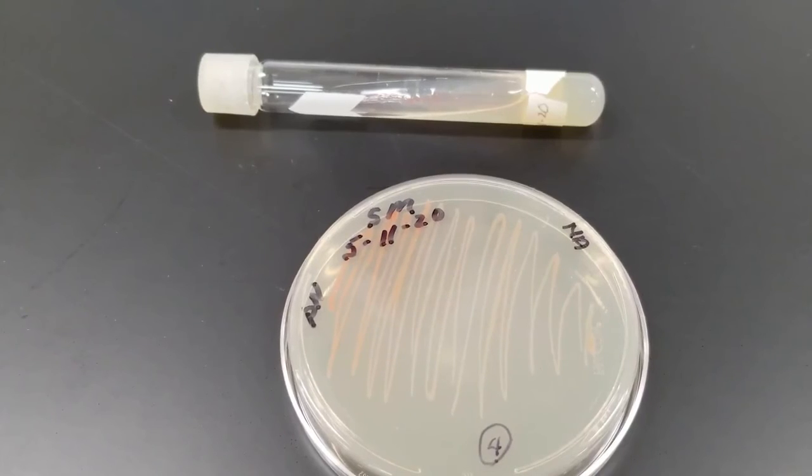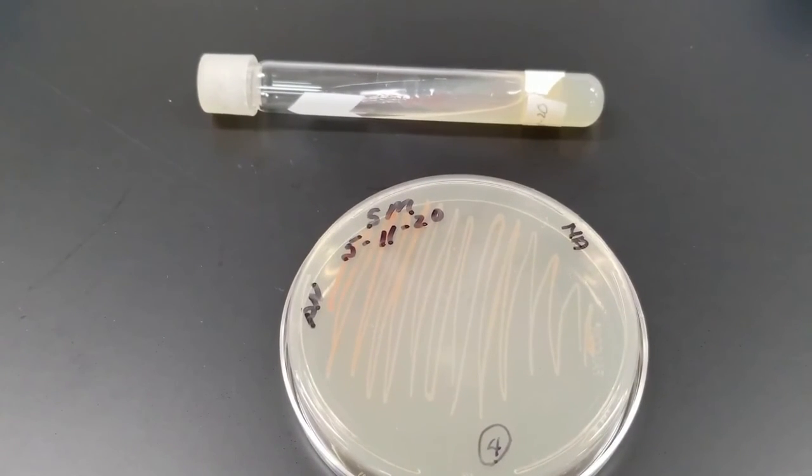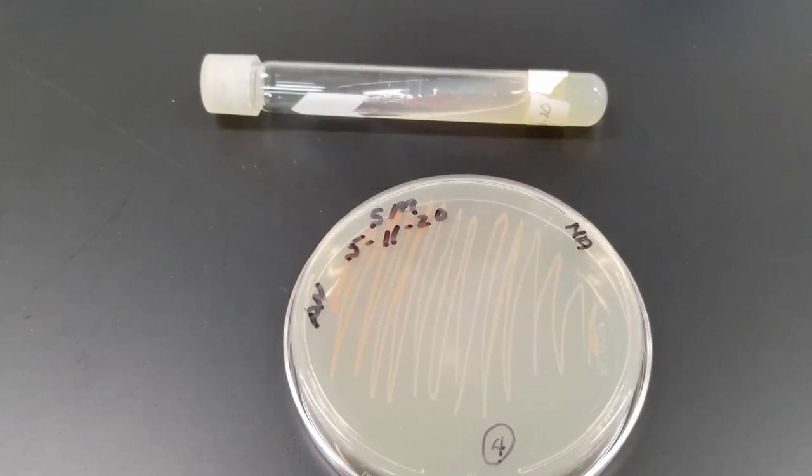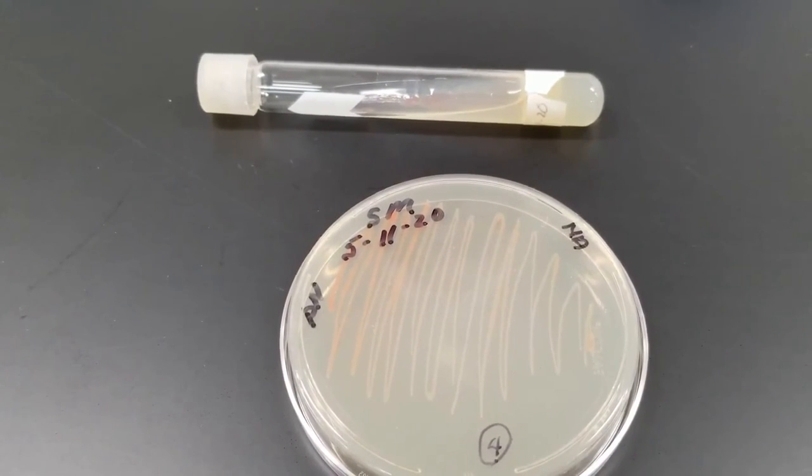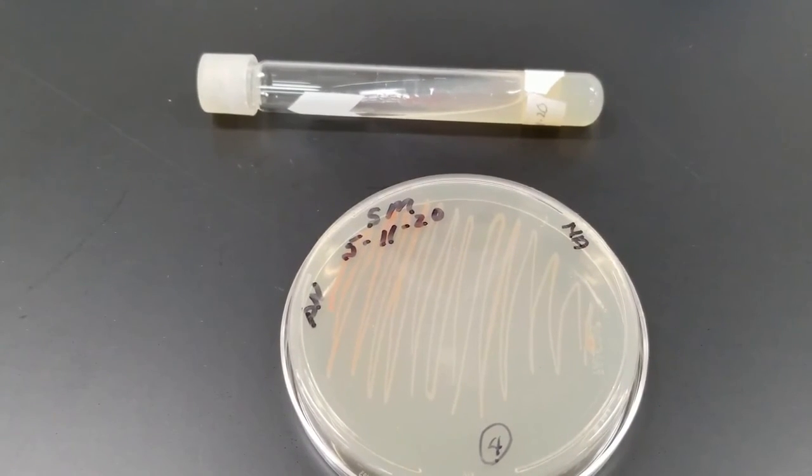Oftentimes you will look at the different characteristics. Nice heavy growth there. Notice the color. One of the big things you'll want to notice is the pigmentation whenever you have a bacterial culture you're working with. That can give you clues as to the identification of it.